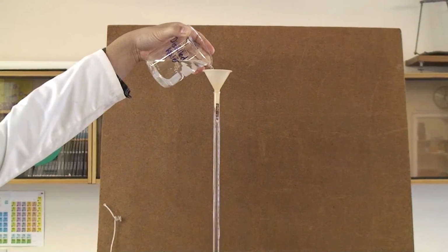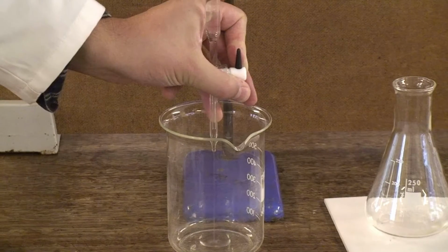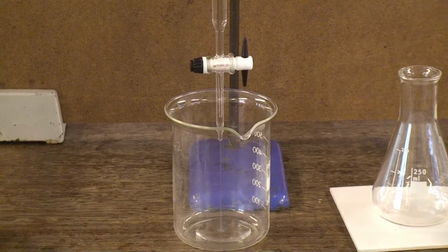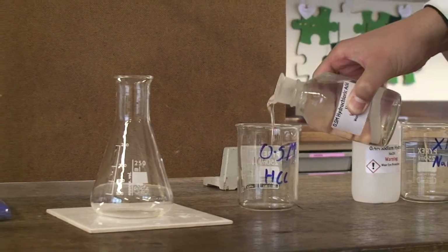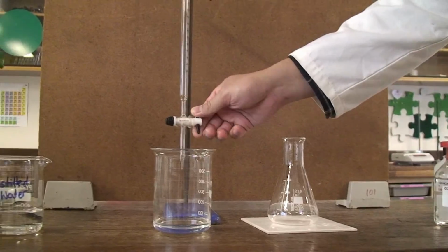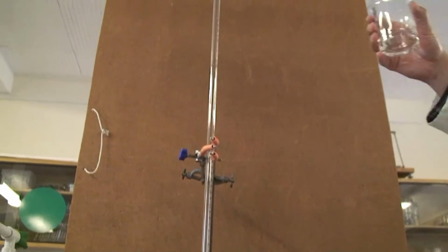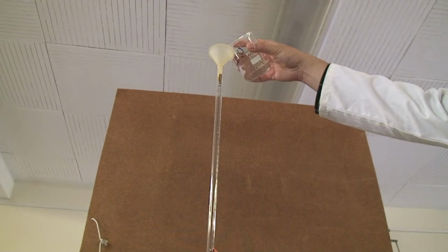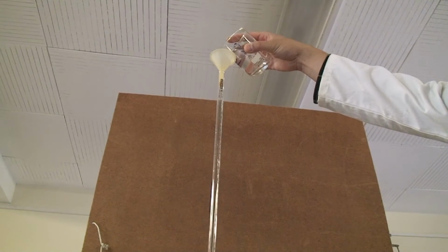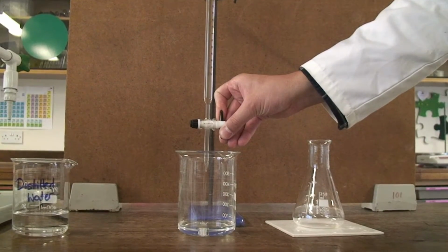To prepare the burette, carefully rinse it with distilled water and open the valve to flush it out into the beaker. After you fill your container with the hydrochloric acid, you want to close the valve. As some water may still be at the tip of the burette, the acid is flushed through to ensure that the analyte, which in this case is the hydrochloric acid, is not diluted from the water. This way it doesn't matter if the solution is stuck, as we will be filling the burette with the same solution again.